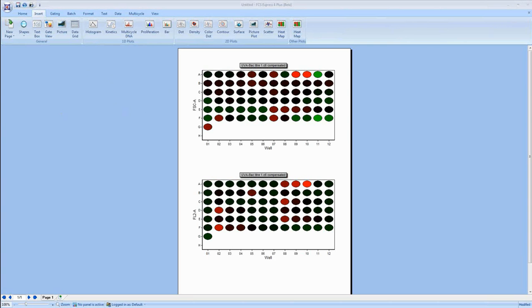Before I do, I just wanted to pause and see if anybody has any questions. The first question we had is, if you run all wells but deem some bad, can they be flagged? I'm actually going to show you exactly that example, how we can flag those wells and also how we can remove them from the analysis in just a few minutes. So you're going to learn all about that, and the answer is yes, we can do that.